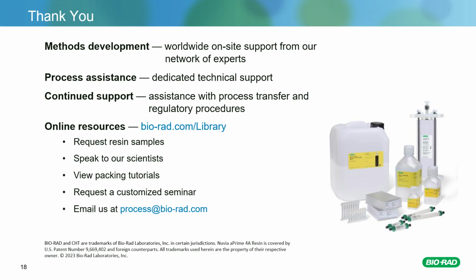Yeah, it's a very good question. At the beginning of the process development, the most important thing is to test a broad range of conditions. So select the relevant factors such as pH, conductivity, product loading, and others I mentioned before, based on your prior knowledge and the risk assessment.